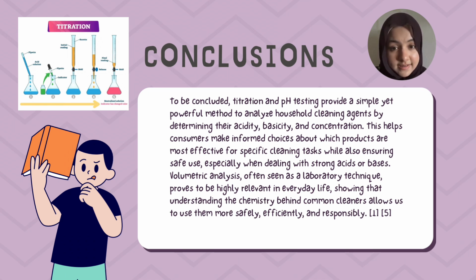Volumetric analysis, often seen as a laboratory technique, proved to be highly relevant in everyday life, showing that understanding the chemistry behind common cleaners allows us to use them more safely, efficiently, and responsibly.